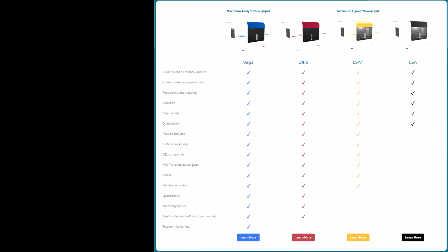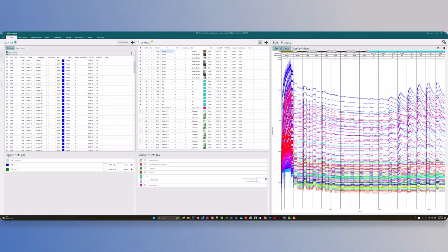This video will discuss how to perform a serial Y alignment in our kinetics analysis software. In this video, we're going to become familiar with how to properly process non-regenerative kinetics experiments or capture kinetics experiments. The purpose of this is to demonstrate a serial Y alignment processing procedure that allows us to properly address the fact that when we have slow off rates, our antigen or analyte is building up on our ligand surface.